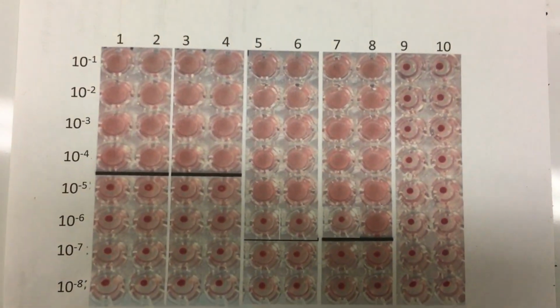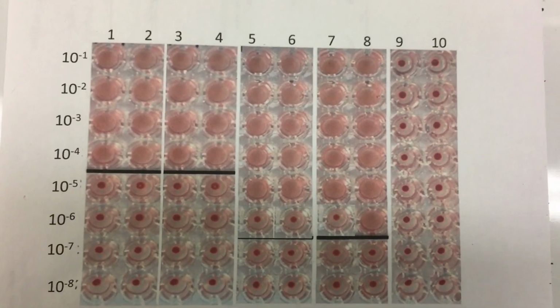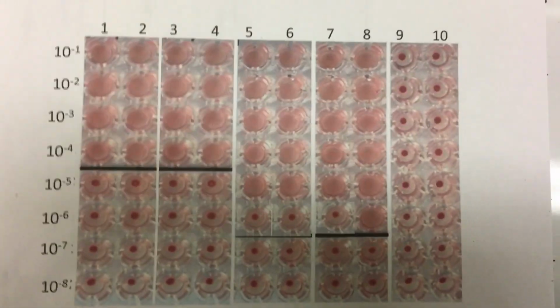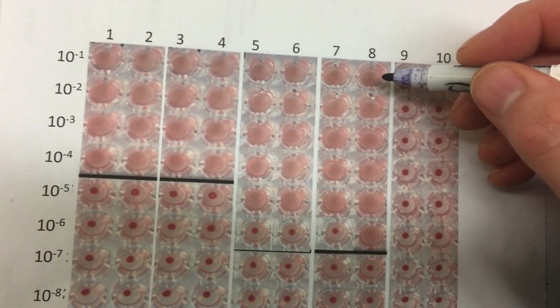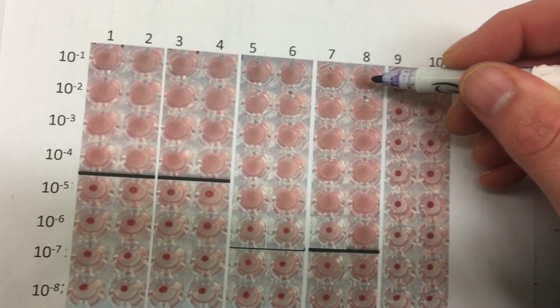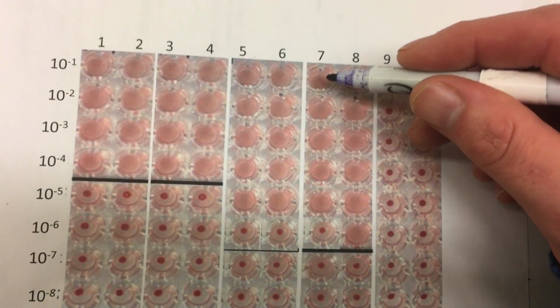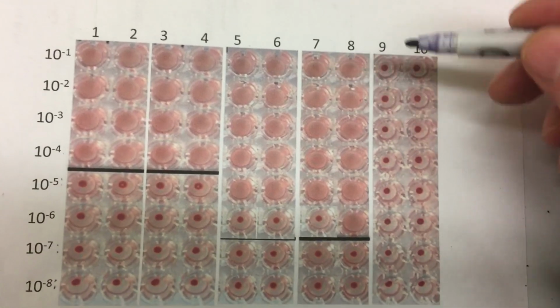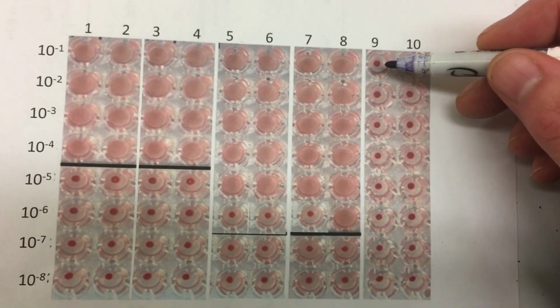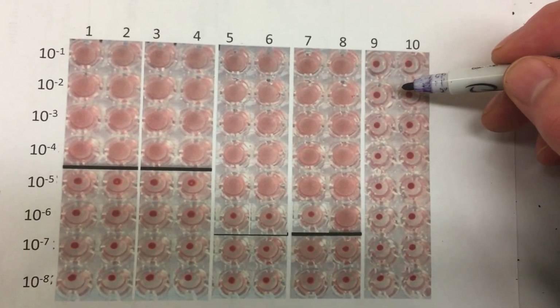So here we have a representative TCID50 assay with pictures from an actual plate that's been joined together, various different wells. If you remember from lecture, when we have the presence of virus, it'll stick to red blood cells and prevent them from falling through gravity. You can see that up here in 7 and 8, the virus is not allowing the red blood cells to button and fall down. In 9 and 10, you have a button present. That means there's no virus present within these wells, okay?